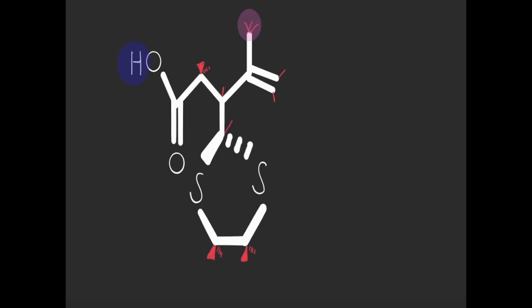This methyl is going to be its own unique signal. This hydrogen is going to be its own unique signal. And this hydrogen is going to be its own unique signal. It's a little darker pink than the one up there. And why are these different and not the same? It's because this is a very rigid double bond. They're not going to rotate, so this is strictly going to see this, and this is strictly going to see that side.